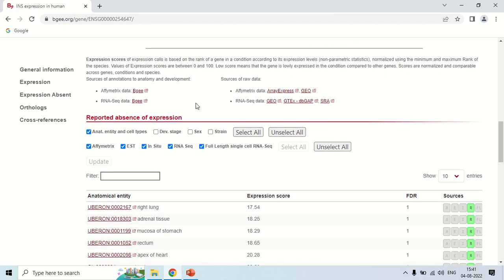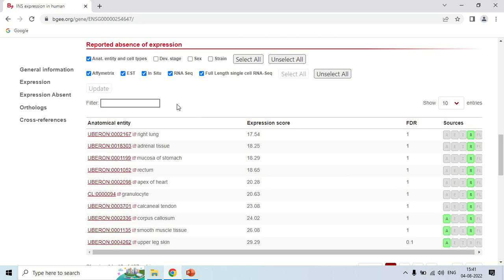If you scroll down, the next table is about the reported absence of expression, meaning in these organs this gene is very little expressed. For example, the first is the right lung where the expression score is very low at 17.54 out of 100 — insulin is not related to lungs so it is very lowly expressed there. The source of data is RNA-SKU. Similarly, in adrenal tissue the expression score is again very low. This table shows the reported absence of expression in various organs.